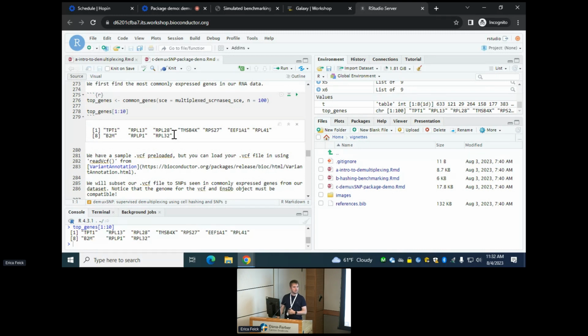I want to talk to you later, but do you think generally that is a good strategy if you're just trying to demultiplex from SNPs alone? We've found it useful, and hopefully it will become apparent as I come down. What we saw with some other algorithms that just operate on the SNPs data, and I'm happy to go into this in more detail later on, is they're unsupervised.